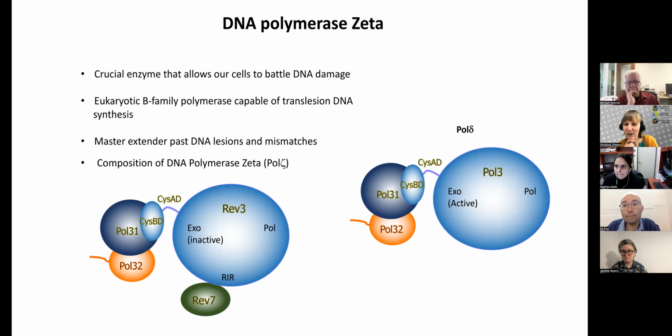All right, I had a question for you as well, actually, Radhika. Your maps look so nice, and you very nicely said how once you've got a really beautiful map, everything else becomes easy. So I'm wondering, does that mean that you had a very biochemically stable molecule to start with, or was there a lot of triaging of particles during your processing? Like how much of how good your map looks came from the biochemistry versus the data processing?